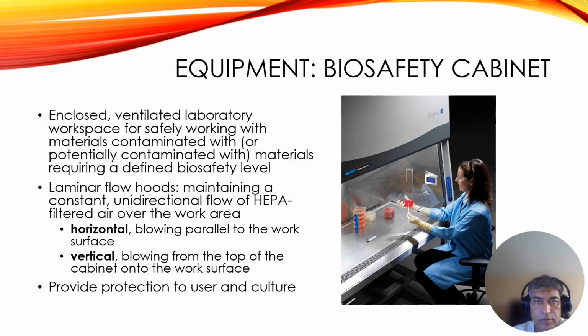In the list of equipment, first is the biosafety cabinet. So what is a biosafety cabinet? It is an enclosed, ventilated laboratory workplace for safely working with materials contaminated or potentially contaminated with agents requiring a defined biosafety level. The biosafety cabinet is also called a laminar flow hood, maintaining a constant and unidirectional flow of HEPA-filtered air over the work area. This airflow is horizontal, blowing parallel to the work surface, and also vertical, blowing from the top of the cabinet onto the work surface. It provides protection to the user and the culture.